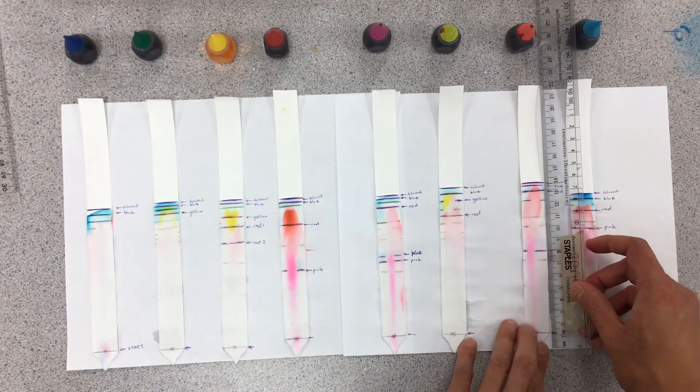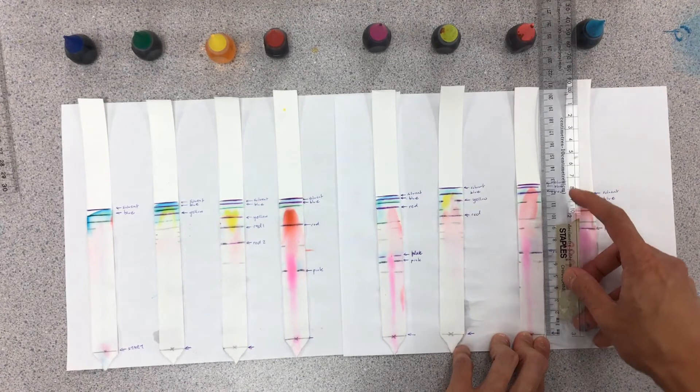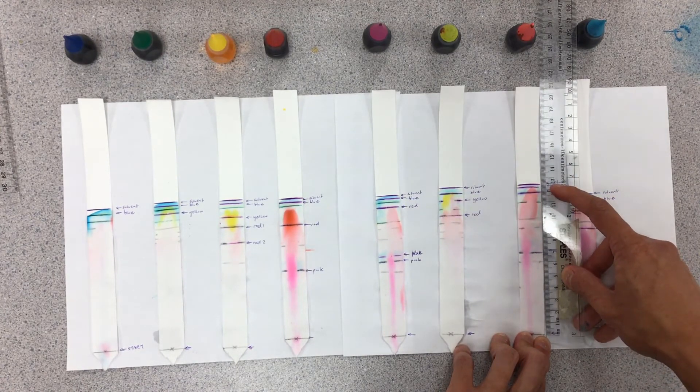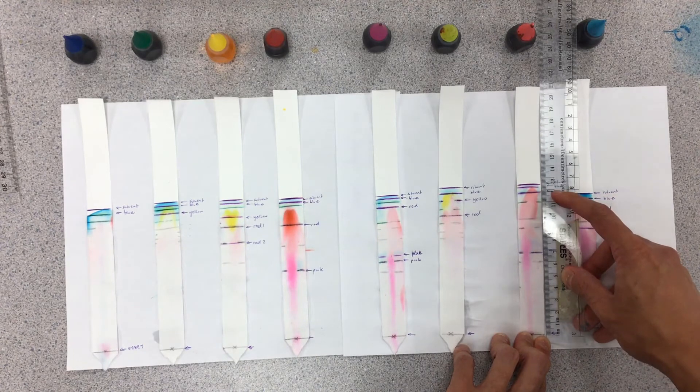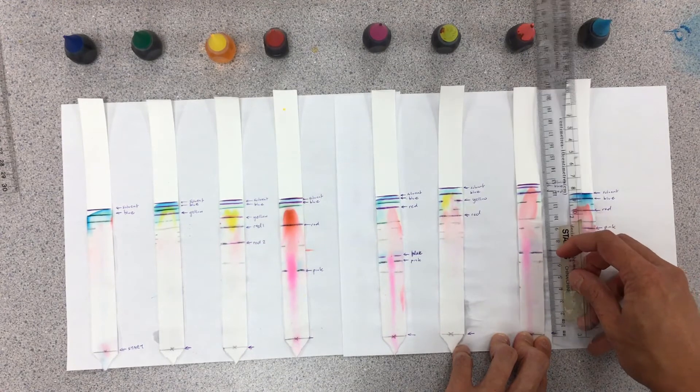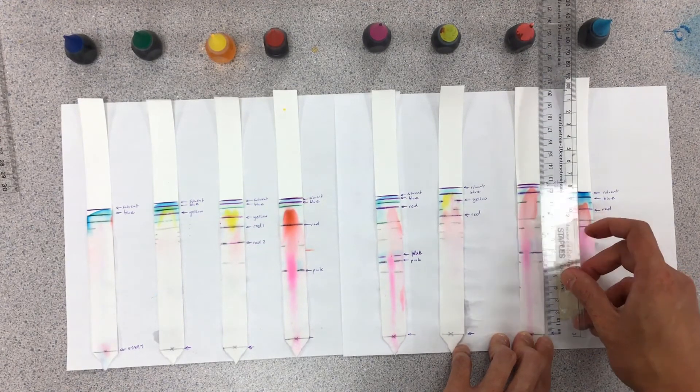Moving on to the second to last one, measuring from the start of our race, from the starting line, the solvent has gone upwards to about 12.5. Blue is about 12.3. This red line is about 12, maybe a little bit under 12, so 11.9. We have a pink line here, probably about 6.8 or so.